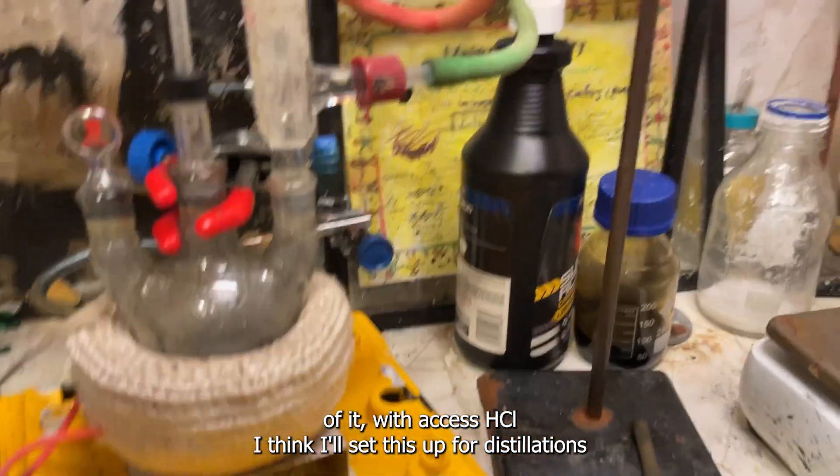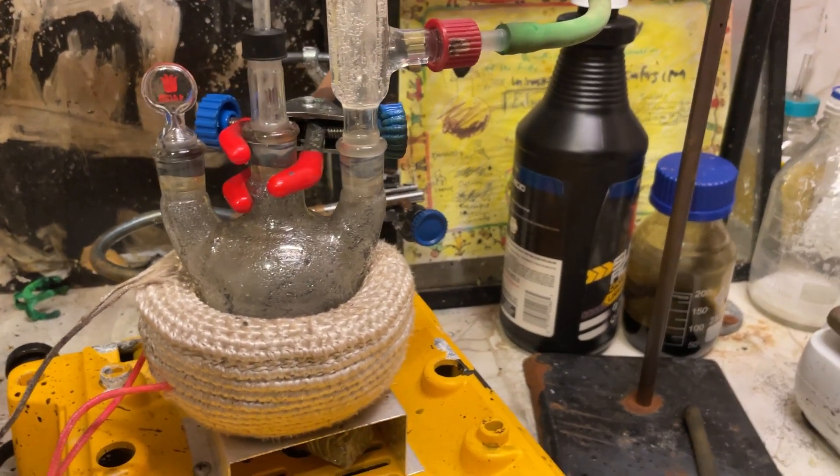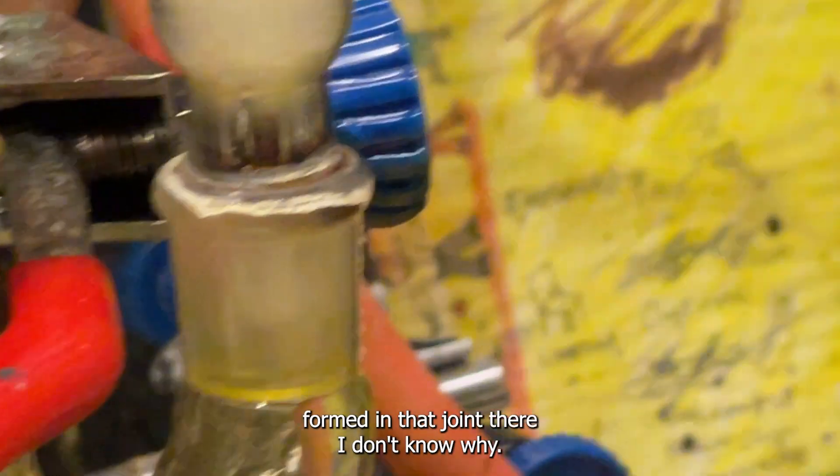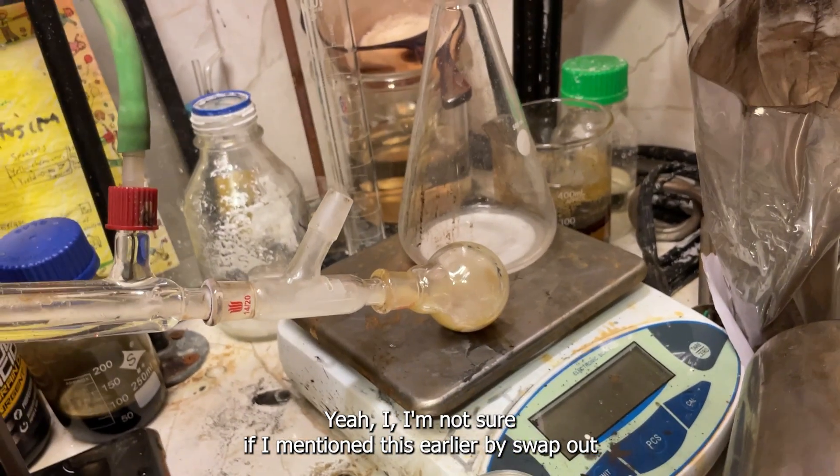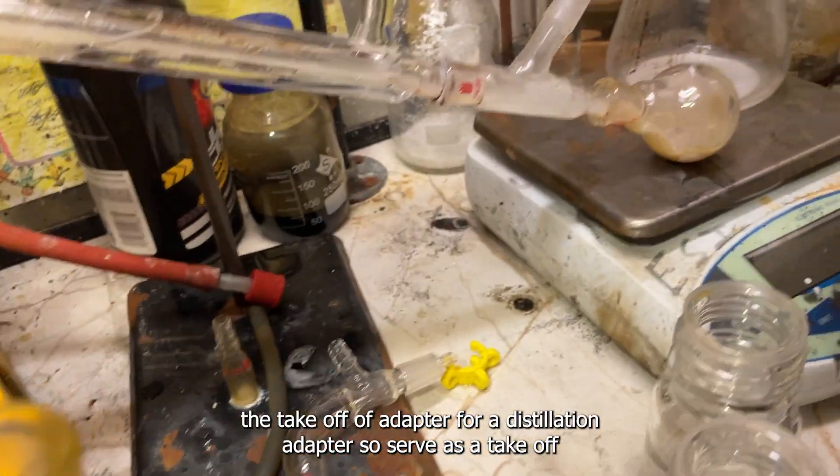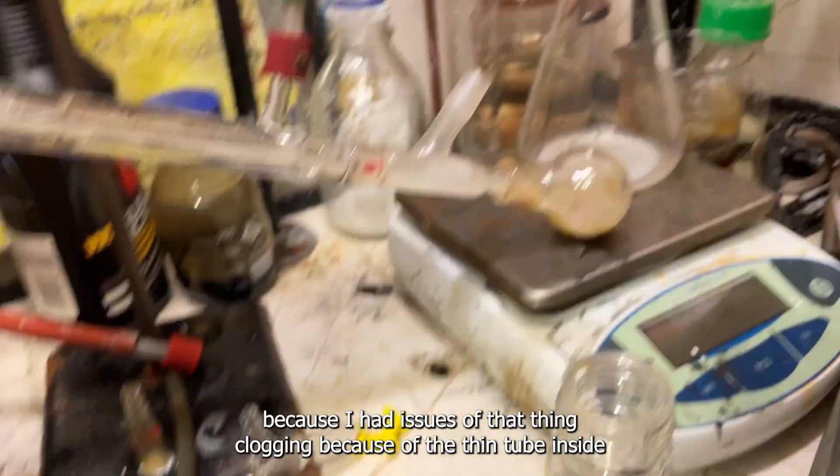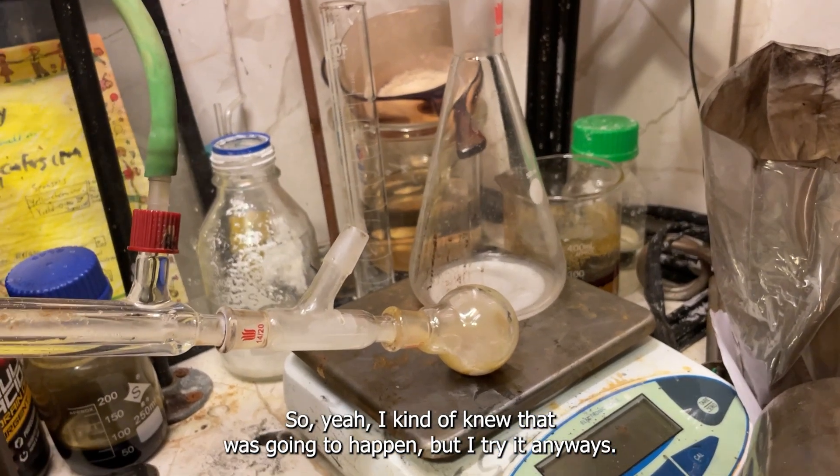I think I'll set this up for distillation with reflux, because that kind of makes a lot more sense. And yeah, apparently an antimony mirror formed in that joint there. I don't know why. Do you see it? I'm not sure if I mentioned this earlier, but I swapped out the takeoff adapter for a distillation adapter to service the takeoff adapter. Because I had issues with that thing clogging because of the thin tube inside. So I kind of knew that was going to happen, but I tried it anyways.